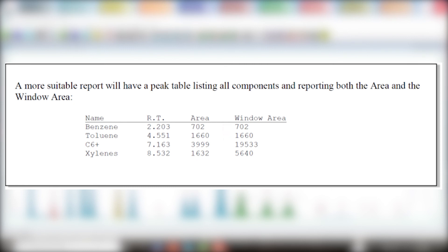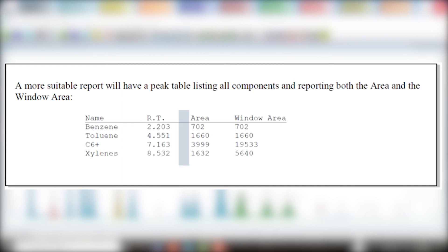For the last two components, C6 plus and xylenes, the area is less than the window area. This is expected behavior for non-nested single-peak search windows and for any multi-peak search window, when more than one peak is involved. The area column shows the area of the center-most peaks. The values are identical to the peak areas shown in the previous table. The window area column shows the sum of the areas of all peaks that are legitimately under the window.